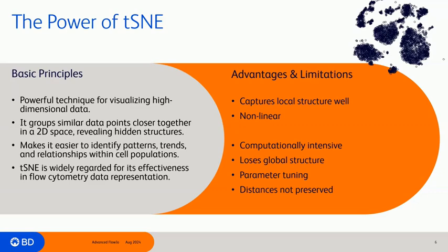And finally, t-SNE does not inherently preserve those distances between clusters. So the spacing between clusters or islands in the output may not really reflect their true relationship in the high dimensional space.